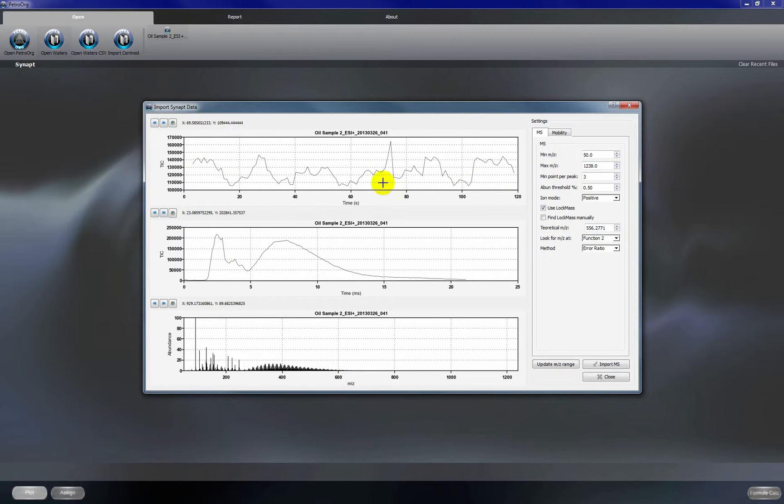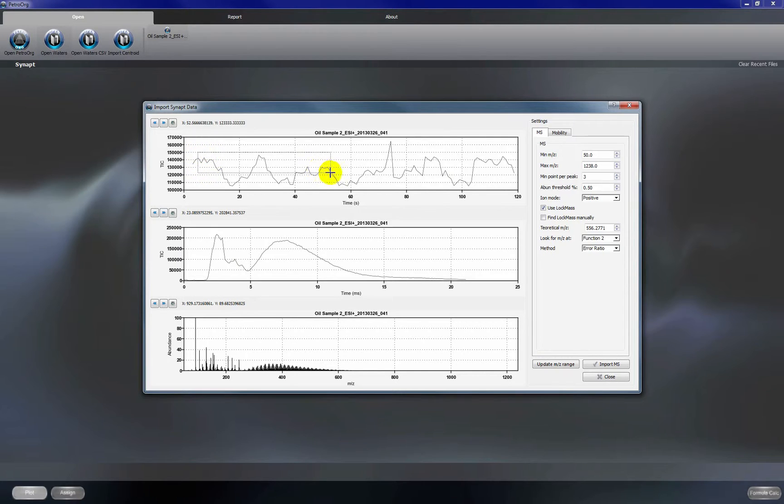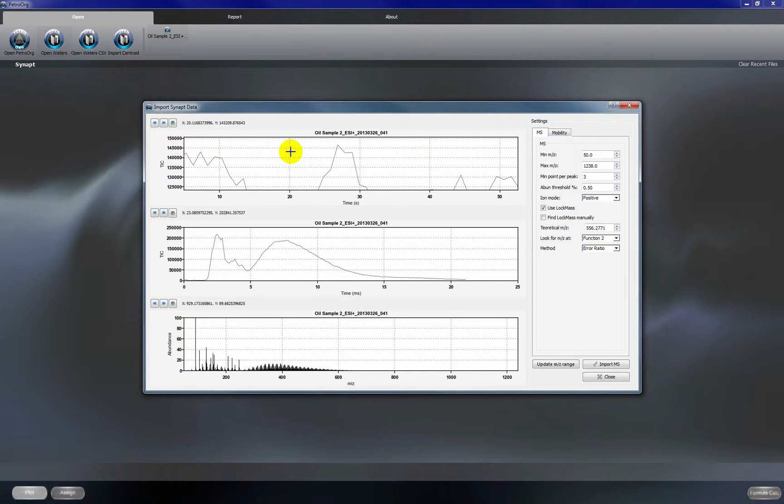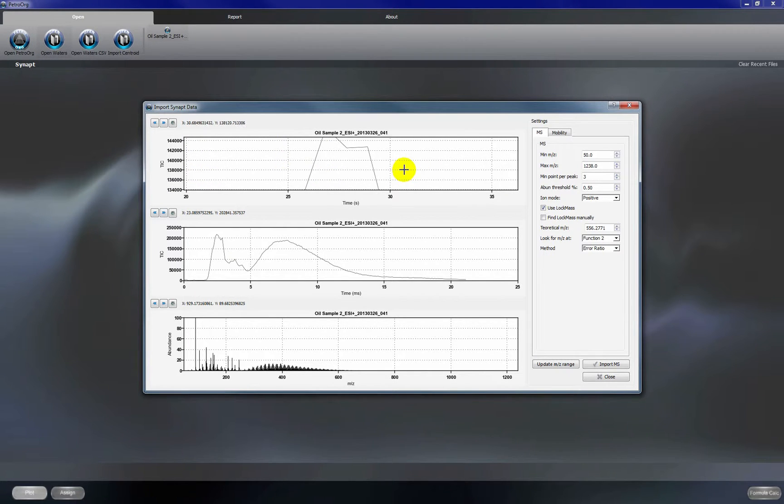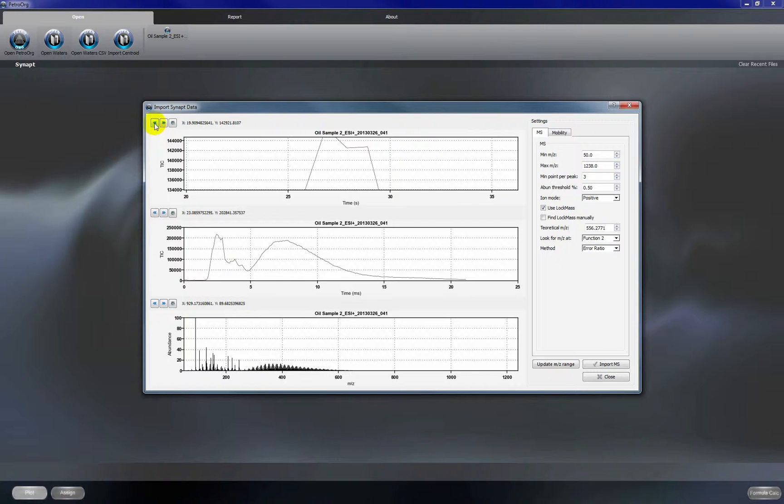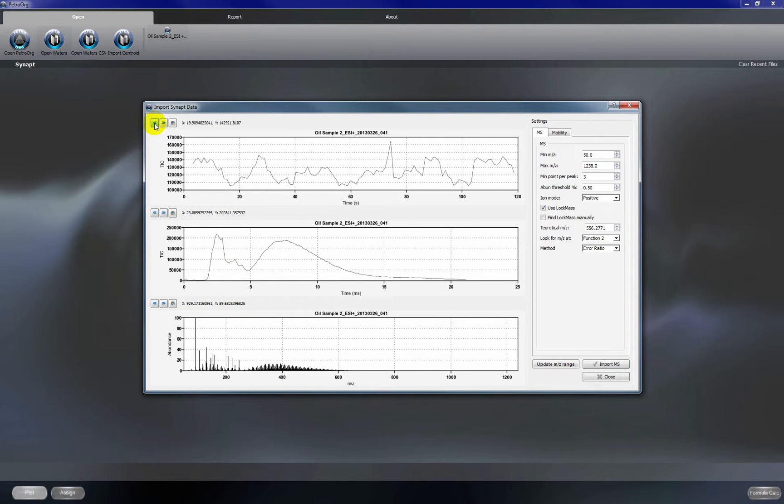So a few things to point out. We can zoom into any region by left clicking and dragging across that region and then we can zoom out by clicking this back button.